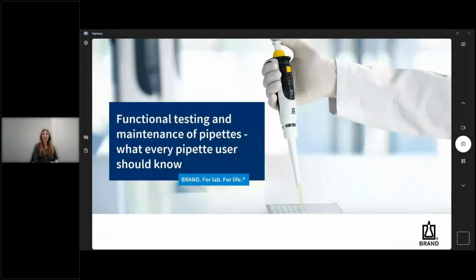Thank you very much, Andrea, for the warm and insightful introduction and for setting the stage for today's session. Welcome to our webinar with the title Functional Testing and Maintenance of Pipettes, what every pipette user should know. We are delighted to have you join us today as we explore the essential practices for ensuring the accuracy and reliability of one of the most critical tools in the lab, the pipette.